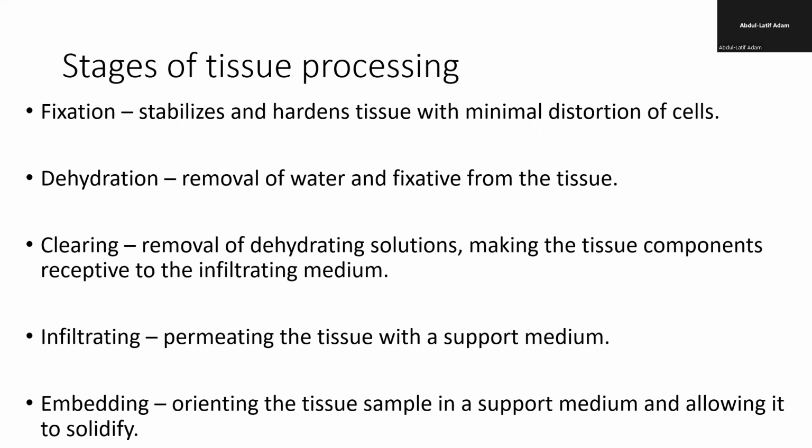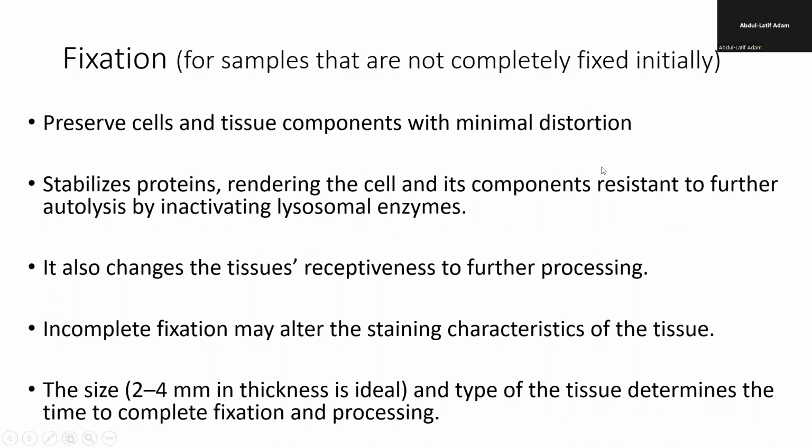After filling up the spaces, you finally embed the tissue in molten paraffin wax and allow it to solidify. You allow it to set and then become solid. That is where the tissue can be kept for a very long time until there is no space to keep it again. Those are the stages involved.